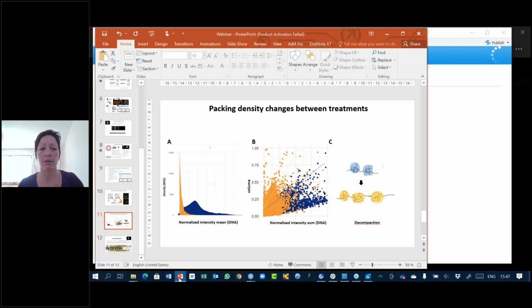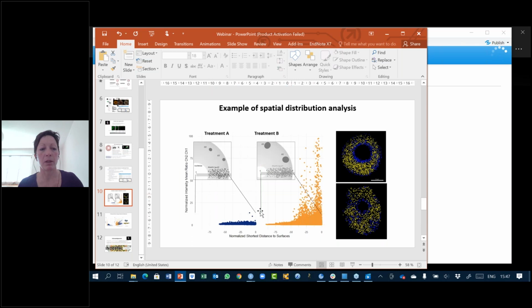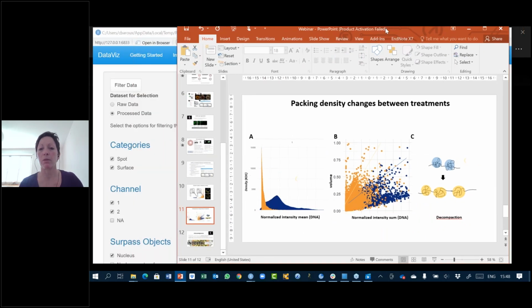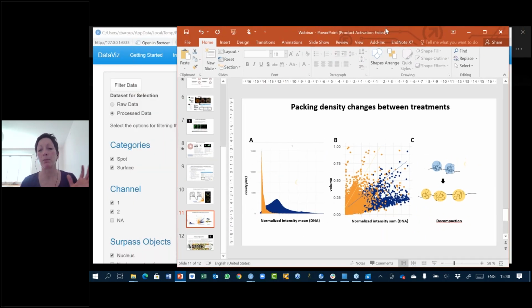Maybe I will let it run. Yes, either here that's a density plot. This is a scatter plot, and here's also a scatter plot, but we have the box plot and histogram function. I think I can just complete by saying that you can also customize the limits of the axes, X and Y, and you can customize the color.